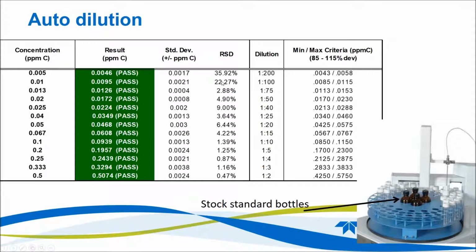You can see there's a little bit higher percent RSDs. Again, this was run in triplicate at the lower end, but that's to be expected since it is such a small absorbance count. So when you're averaging out 3 absorbance counts at such a low level, you're going to get higher RSDs. But beyond that, they look really, really good. You can easily expect less than 5%, if you're going above reagent water level, like I said, which is about 50.